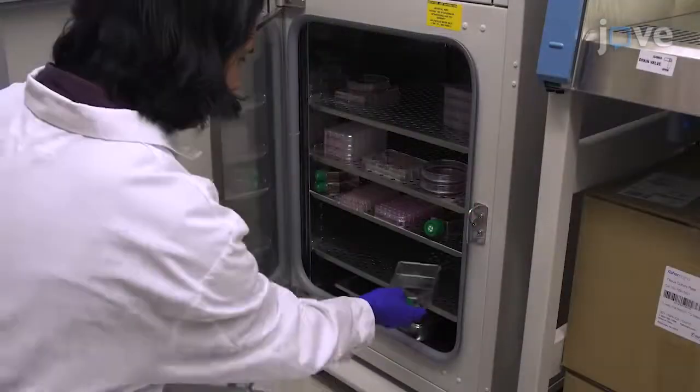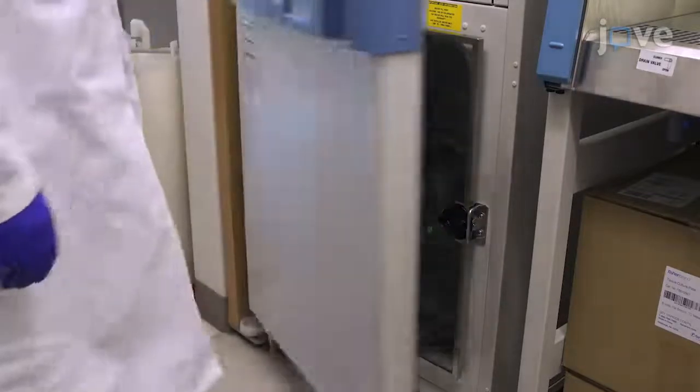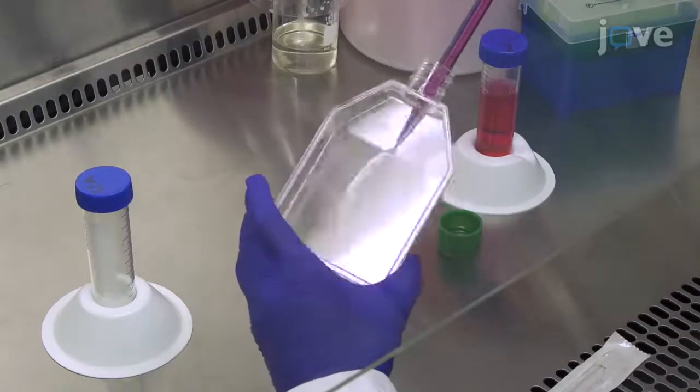Transfer the flask to a 37 degrees Celsius incubator for 5 minutes. After the cells have been detached from the flask, suspend them in 10 milliliters of growth media.